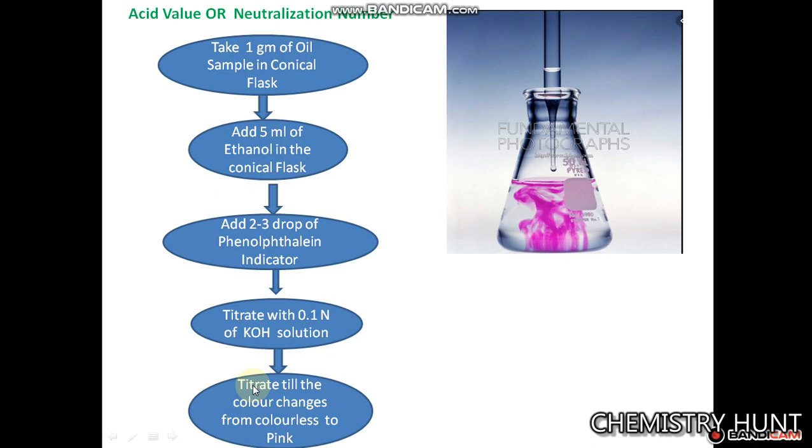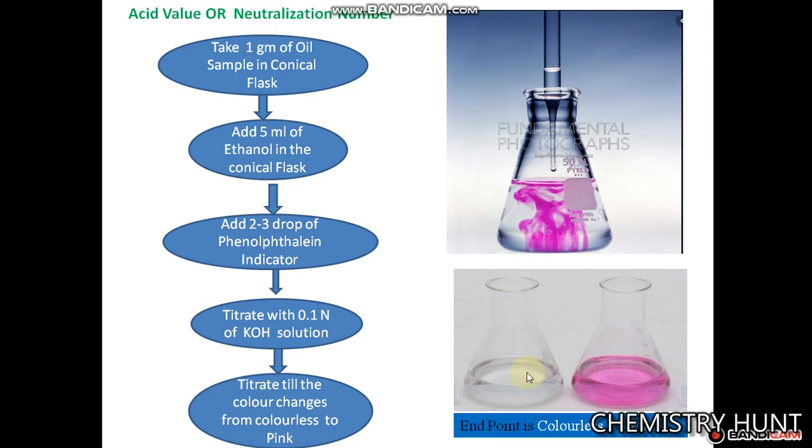When it is titrated, the color changes from colorless to pink. The endpoint is colorless to pink, which means we have to titrate till the color changes to pink.